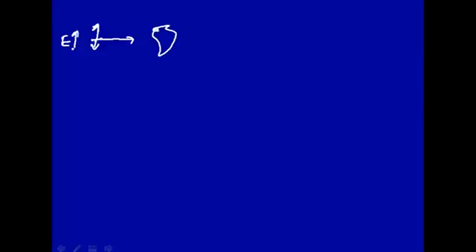This electric field oscillating up and down, the electrons are polarized, and the electrons, say, are initially up this way, but then as they interact with the electric field of light, they go up and down, and in general light could be polarized one way or the other way in the x or y direction. If this is a z direction, this is plane polarized light, and in general you could say it's polarized one way or another. So what one has is, let's write this way as a dipole.